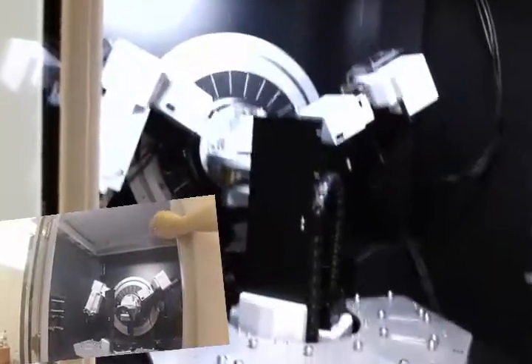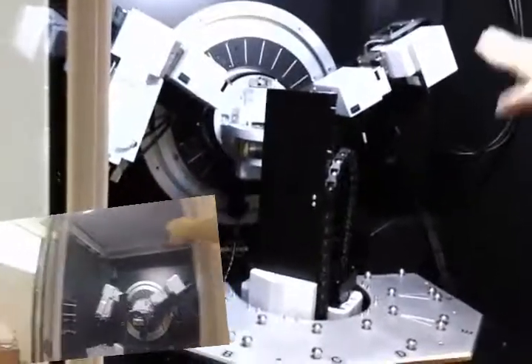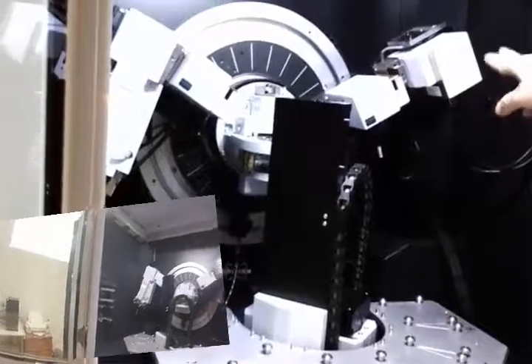This is an area detector — it's a 2D detector, not a point detector. It has multiple strips inside, so it is significantly faster than a point detector.